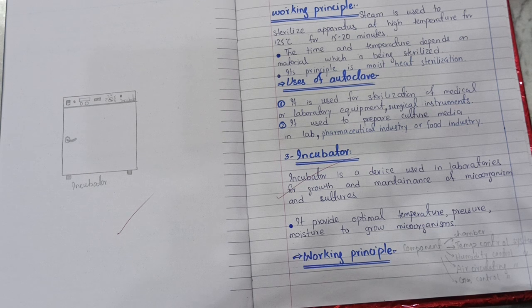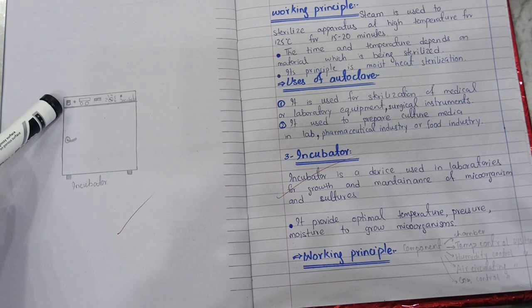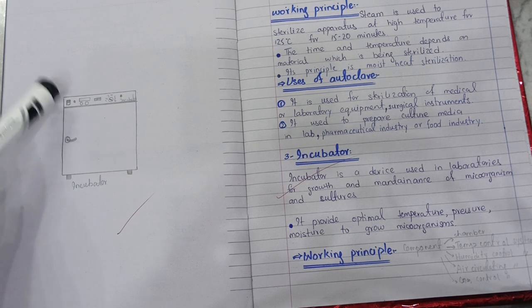If you are using a fungus, it has different optimum conditions. So you should give the optimum condition, and after that you can see the growth. On this incubator, a lot of temperature and pressure controlling valves are available. You can control it from that side.